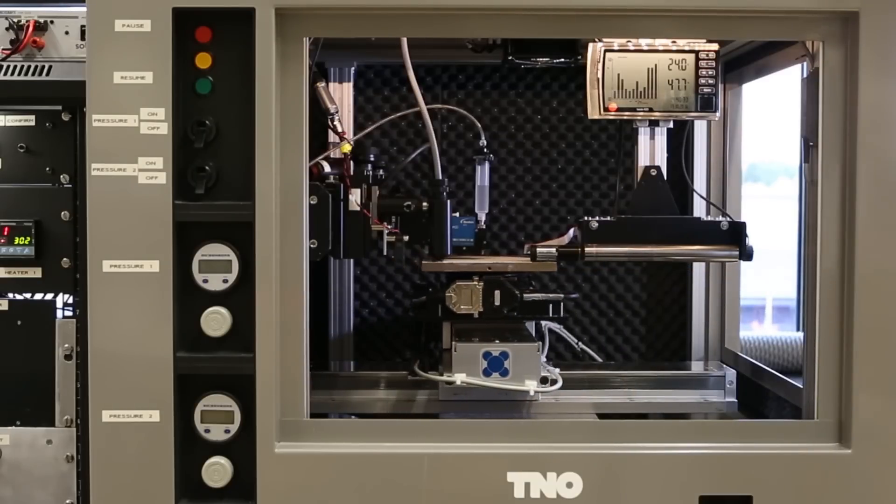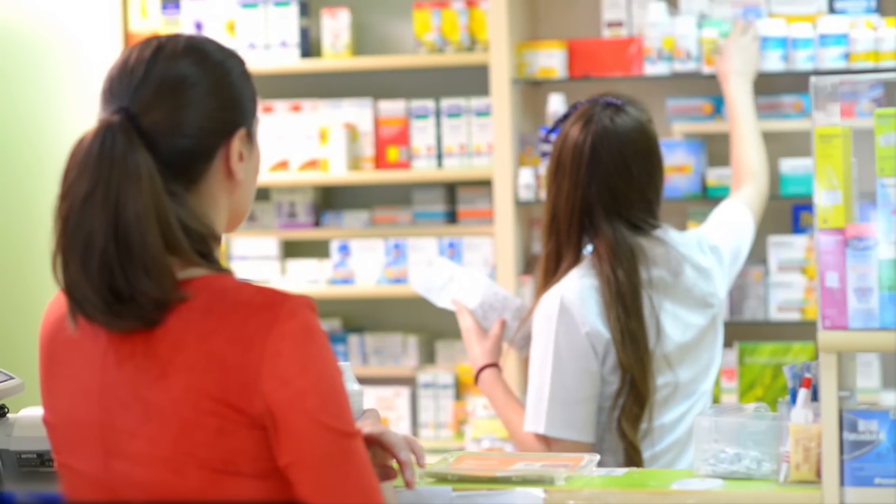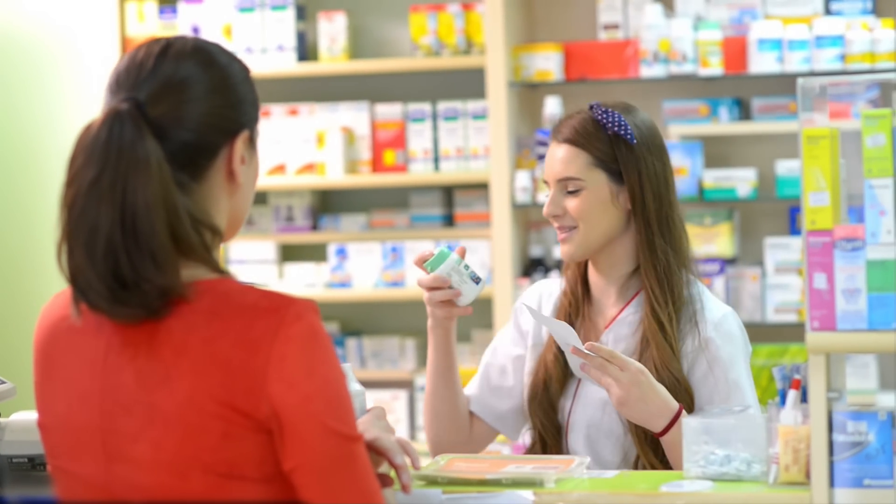The U.S. FDA has recently approved the first 3D printed drug for use. With this approval, the market is open to the possibilities of 3D printed pharmaceuticals.